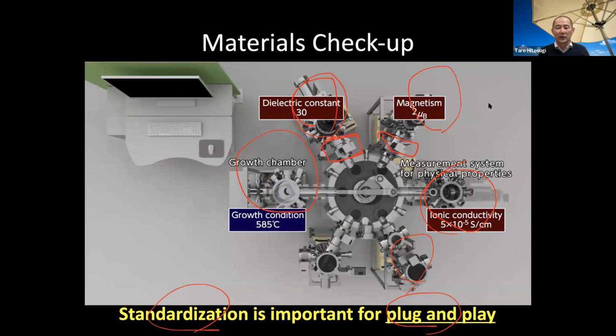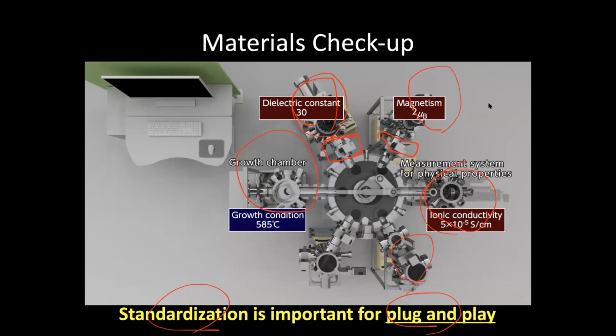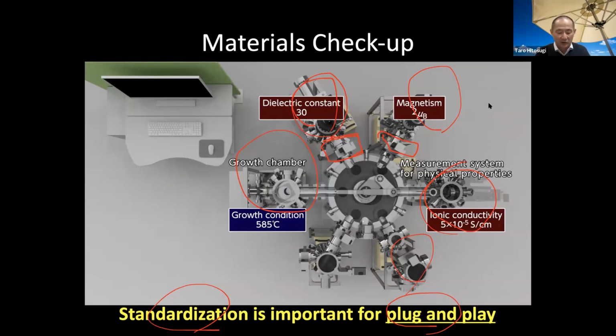I see. So for the phase diagram, this is sputtering. So you work on thin films, right? Yeah, we do a lot of MBE, but we've done other materials or other processing as well. For the sputtering, this is a very good way to reproduce materials and synthesis, and a very stable technique. So we can reproduce this phase diagram. So the reproducibility is very high, and also the thickness. We deposit thickness around 100 nanometers. And then we measure the thickness by fringes using X-ray diffraction, or we try to install ellipsometry to confirm this film thickness.